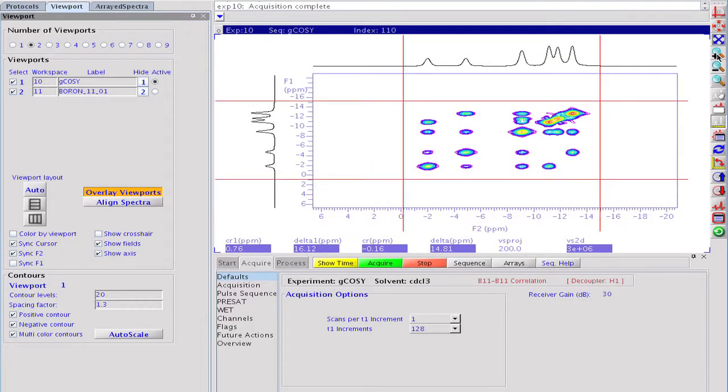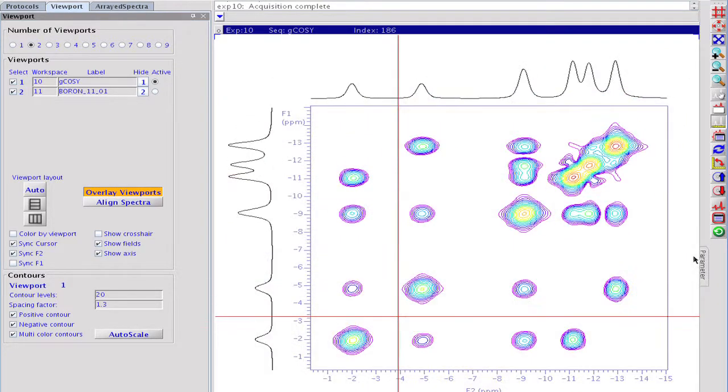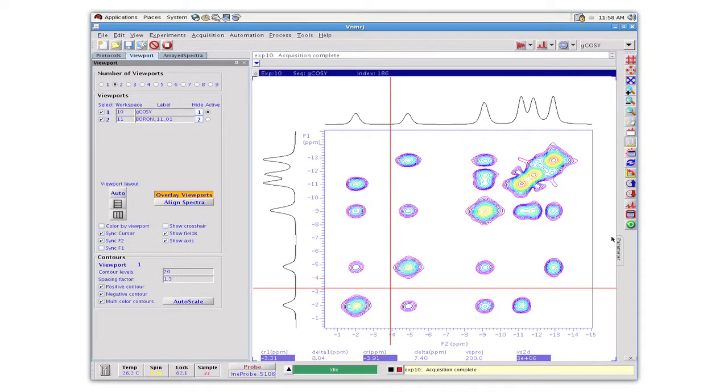Interestingly enough, these interactions remain hidden in the 1D line widths due to fast boron relaxation. As we have just seen, adding a boron and boron COSY button to the experiment selector is a fast, easy, and robust process. The new protocols are fully integrated with all the other features customers have come to expect from VNMRJ3.